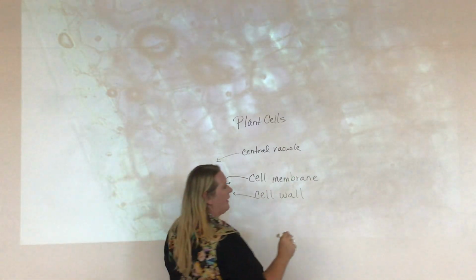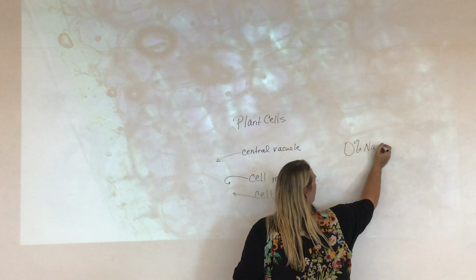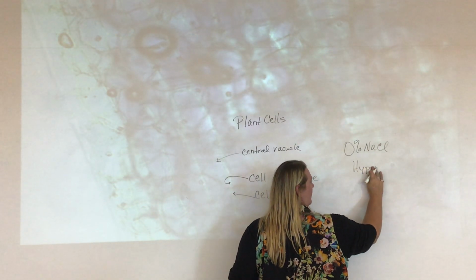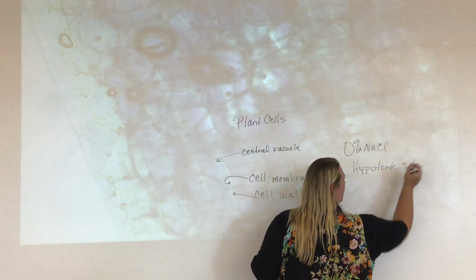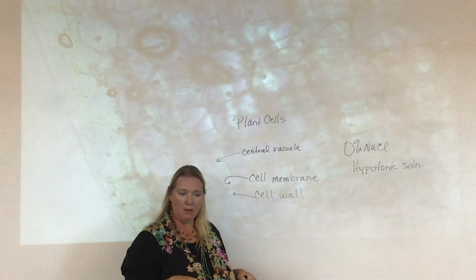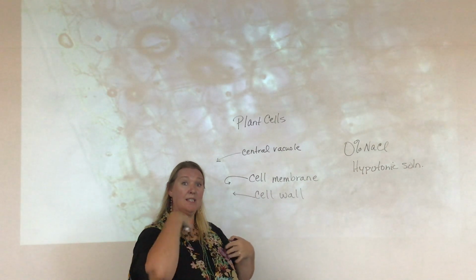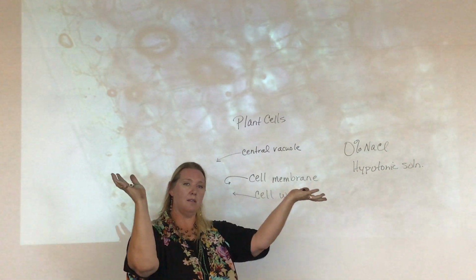We have put this plant cell in distilled water, 0% salt. And you guys figured out that it was a hypotonic solution. In the animal cell, the red blood cell, it was the last microscope picture that I took. It was the first test tube where we could see through it, where the water went into that cell and they swelled up until they burst.